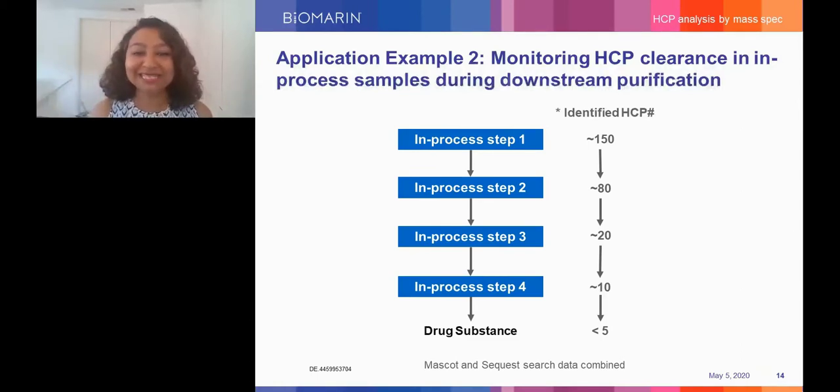And you can easily see from the data that before purification starts, you see a whole bunch of other proteins. And this is 1D data. If you do 2D, you probably see hundreds of proteins. But as you go through the purification step, you can see how these are removed.